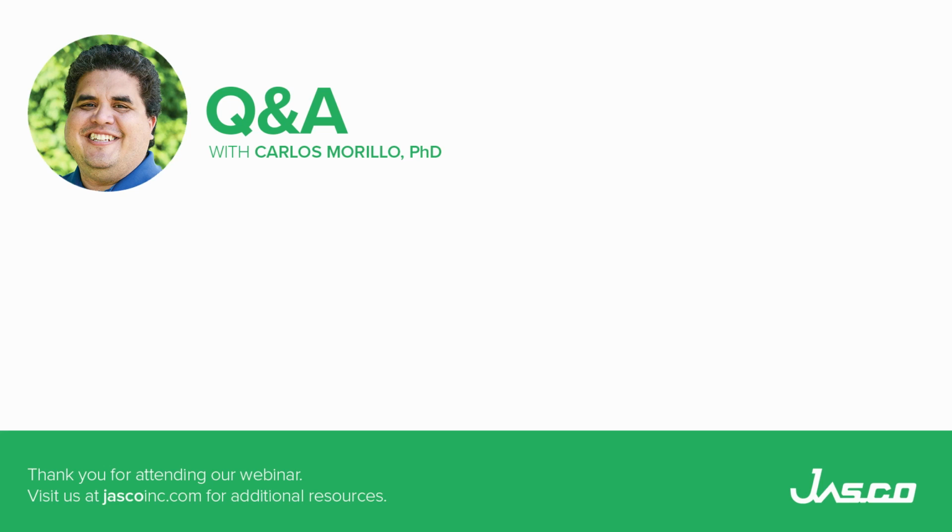How can Raman give more information than other techniques with graphene? Well, that is a very good question. I'm familiar with the measurement of graphene using Raman. I haven't studied graphene with other techniques.